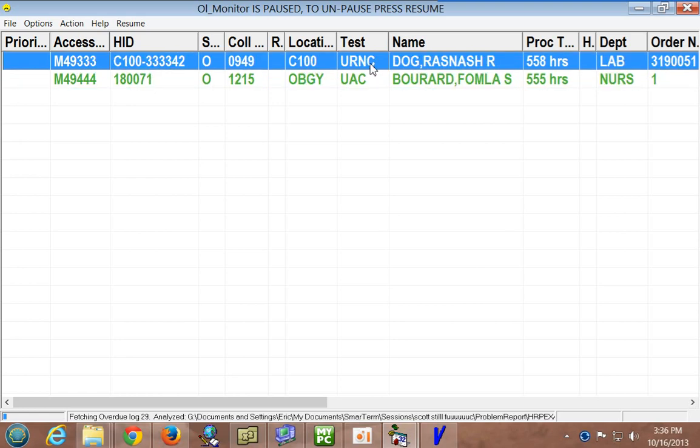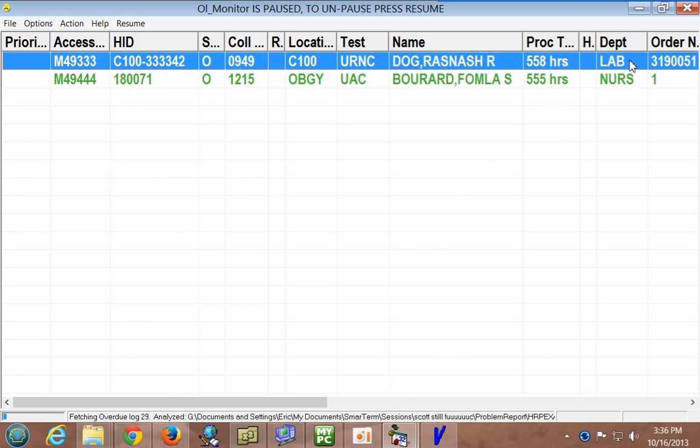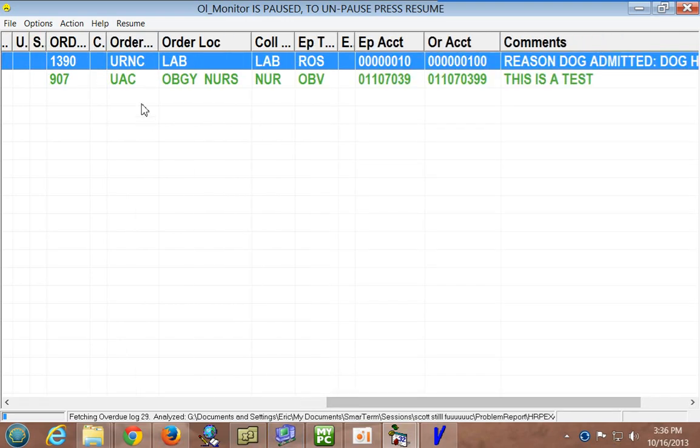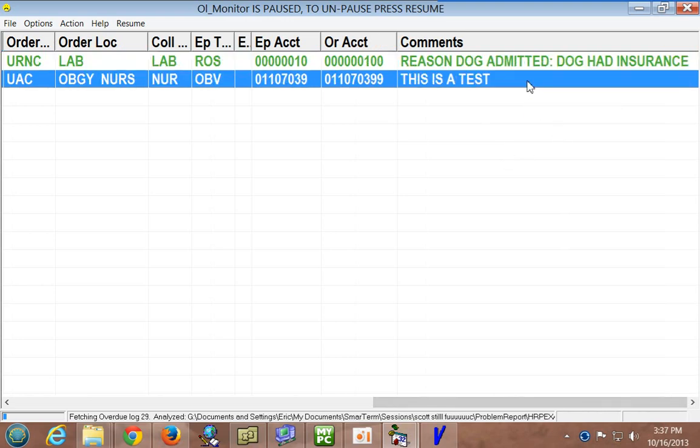This looks like a urine culture. Somebody forgot. And whatever, UAC, someone forgot to act on that one. Nursery. And collection department here is a lab. Anyway, you've got your order number, your location, ordering location, all this information, and even the comments line. I had a little fun with this one.